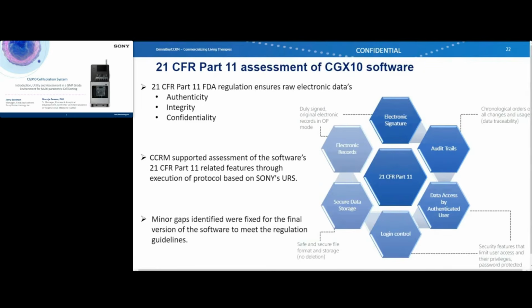As part of the GMP readiness assessment of CGX10, CCRM supported assessment of the software's 21 CFR Part 11 related features through execution of protocol based on Sony's URS. Minor gaps identified were fixed for the final version of the software to meet the regulation guidelines.